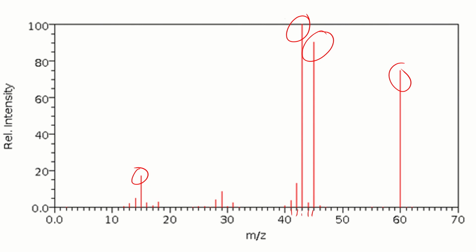So you go from graph to graph, pulling the useful bits of information from all of them, and then when you have gotten all the information that you need to make a possible identification, then you go back and start identifying fragments. The things used to check your work are the number of carbon environments present from the 13C NMR graph, and also the mass and possible fragments from your proposed structure in the mass spec graph.